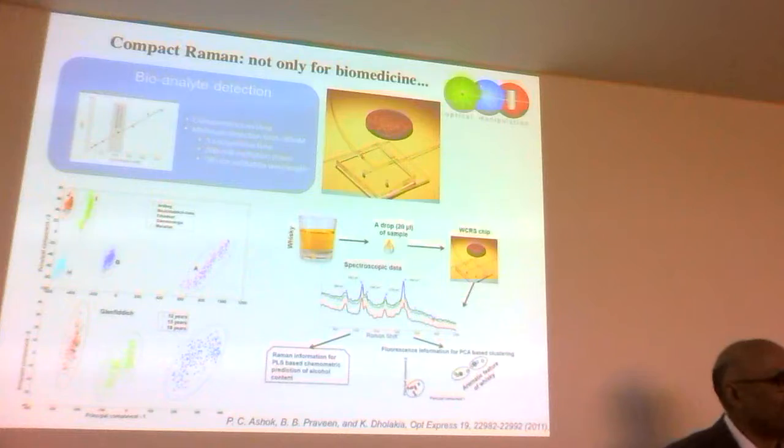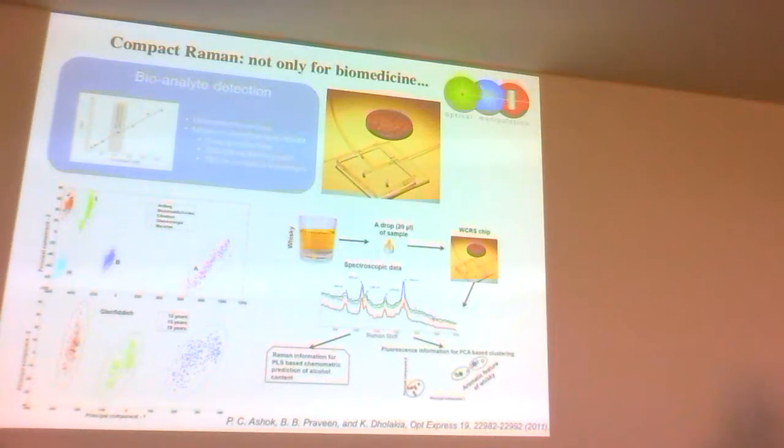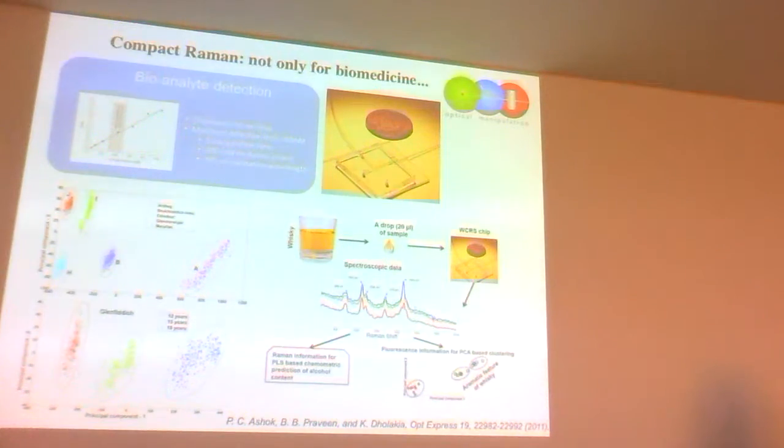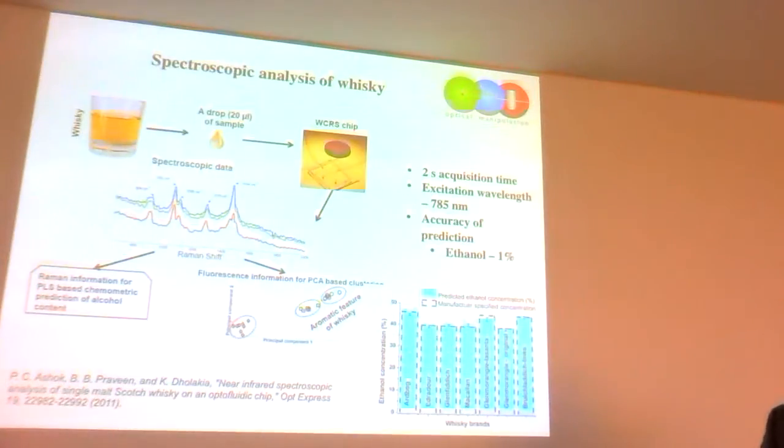I'm just trying to show you how powerful these amazing multivariate techniques are, and this is a real-world solution that has now come to market from us, and now people are wanting to do it through the bottle. So you can go to duty-free and just point it at a glass. There are other problems there, because the glass is going to be different, and it's maybe a little bit too hard to be as realistic. But this is very, very exciting for us to do.